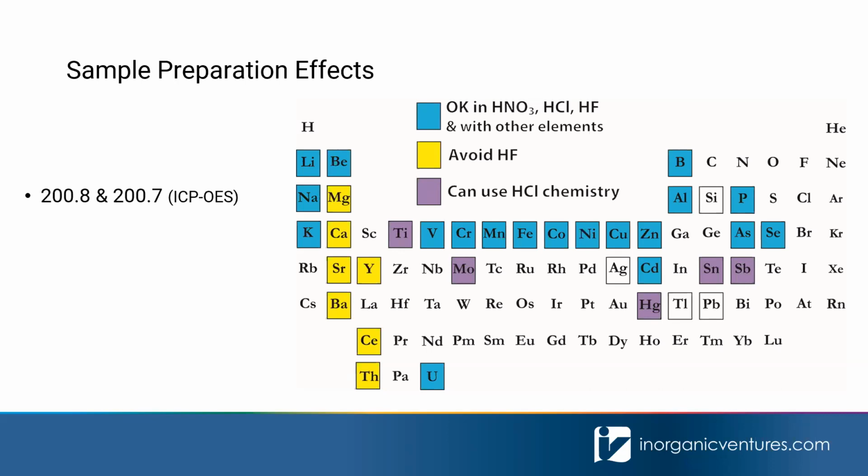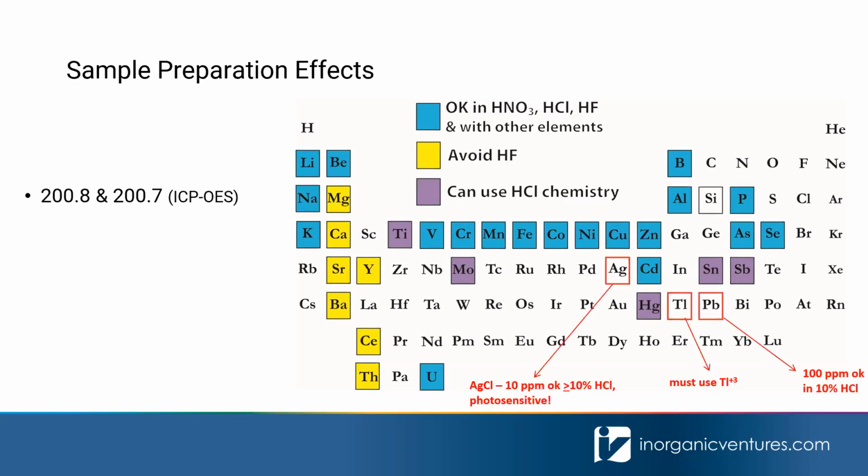We can help you design solutions that will be stable because we'll be focusing on HCl chemistry. However, if you do have HCl, whether it's part of your sample preparation or your method, you want to consider its effect on the 3 elements that are highlighted in red.